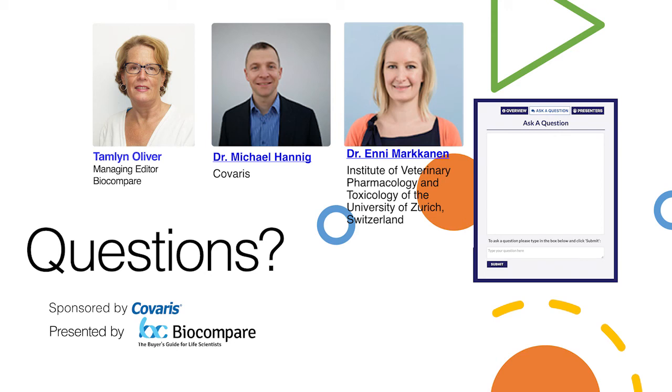Yes, H&E staining. So that's something we tried out first. We have to stain our samples because otherwise you cannot reliably differentiate between stroma and tumor cells or anything really you want to isolate in LCM. So we do necessitate staining of samples. In the beginning, we compared H&E, Cresyl Violet, and 2 or 3 other methods of tissue staining. And what we figured out, in our hands at least for stroma, is that Cresyl Violet seemed to work absolutely best, also in terms of RNA quantity and quality that you could get out of the samples.